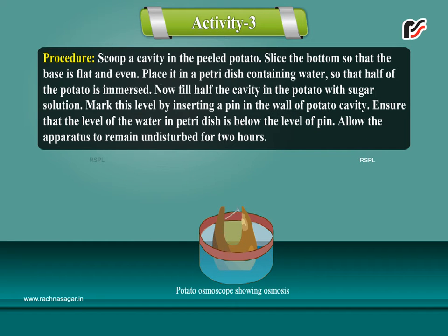Mark this level by inserting a pin in the wall of potato cavity. Ensure that the level of the water in petri dish is below the level of pin. Allow the apparatus to remain undisturbed for 2 hours.